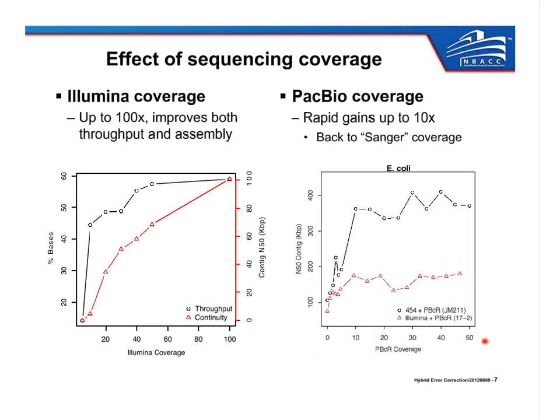So a question that we're commonly asked is how much coverage is required to take advantage of this process. Here I've shown it from 2 angles: the required Illumina coverage, which represents the coverage you need in the correction technology, and the PacBio coverage required, which represents the coverage needed for the single molecule sequencing. The preface is that you don't need to use Illumina for correction. Any of the second generation or any highly accurate short read technology is sufficient for correction. For instance, you can use 454 correction, which works quite well. You can use the PacBio CCS, which is their circular consensus sequencing technology, to correct their single pass reads. That works quite well, and Sergey will have some results on that coming up.